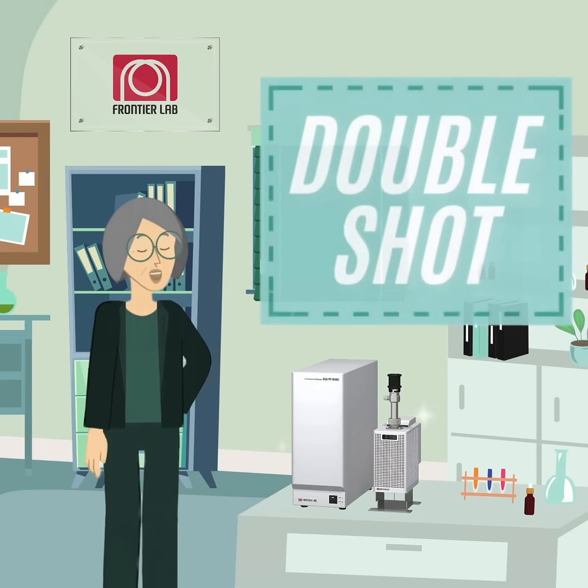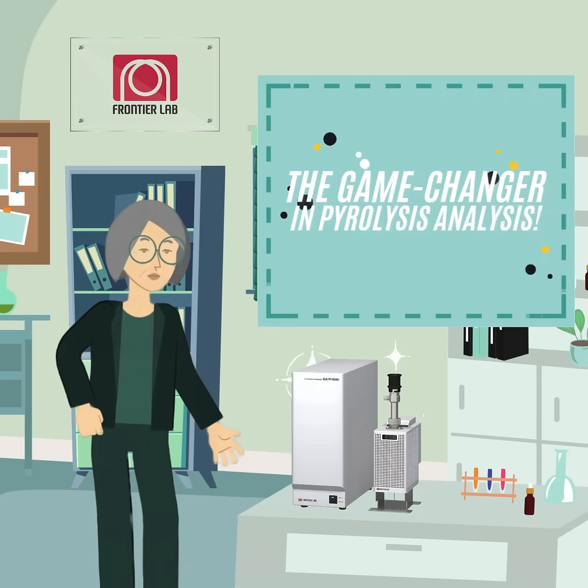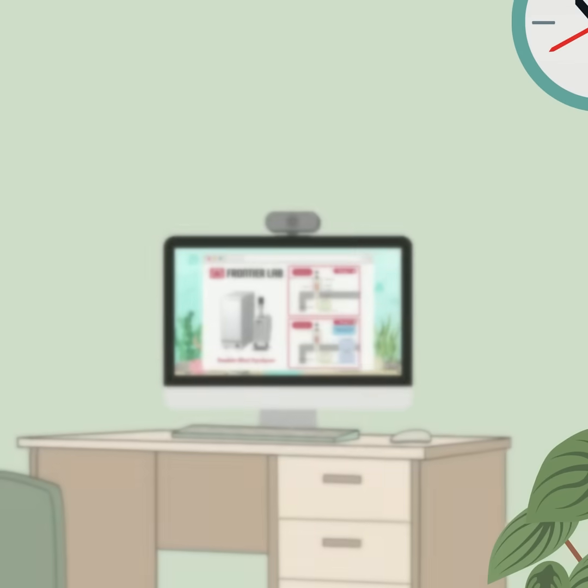Let me show you why the double shot method is a game changer in pyrolysis analysis. The double shot method works seamlessly in two stages, following a clear step-by-step process.